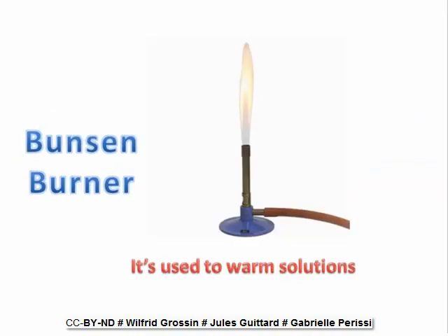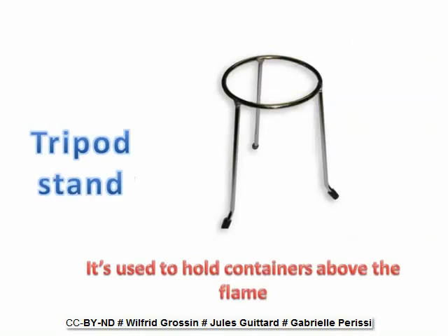Bunsen burner. It's used to warm solutions. Tripod stand. It's used to hold containers above the flame.